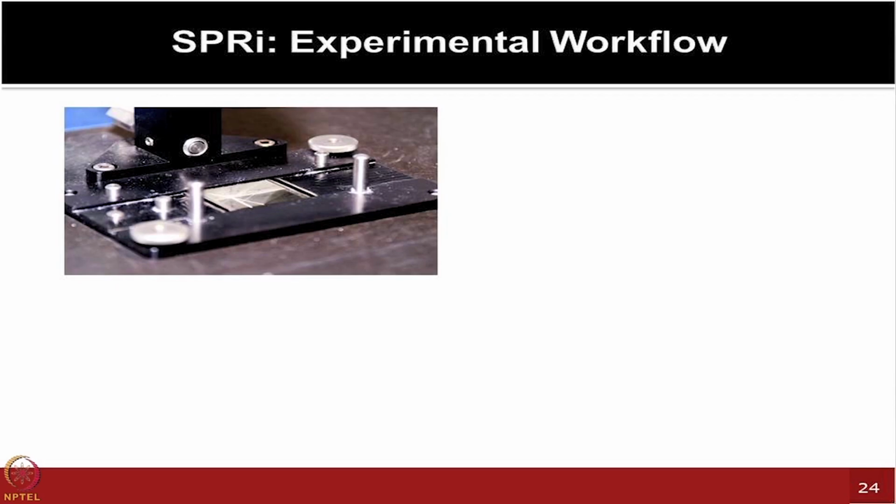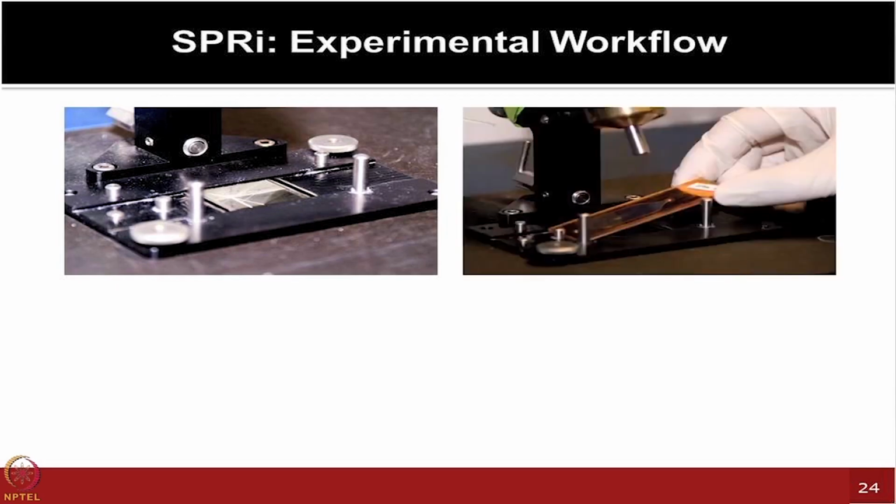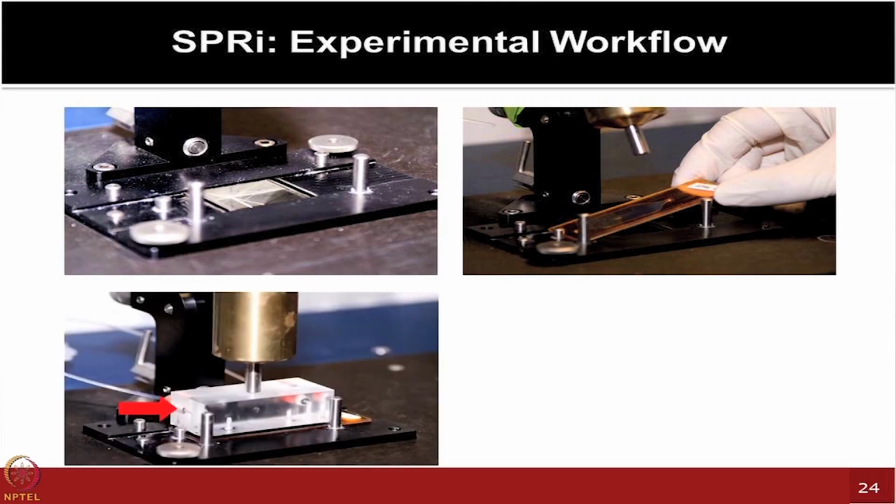So this is a prism here, and this is a microarray kind of chip, where you can add all the protein features which you want to analyze. There are certain holes on both sides, and these holes you can combine with the flow cell from which your liquid can come and pass, which you want to test. Then you can screen the whole chip surface on the SPR setup.